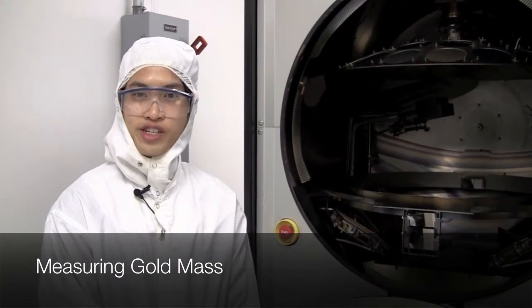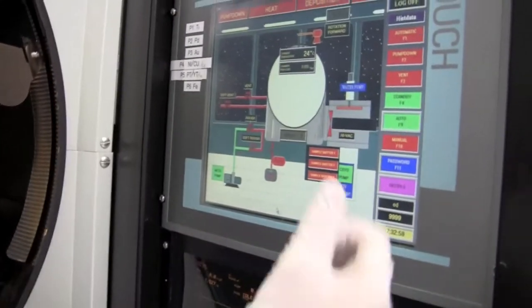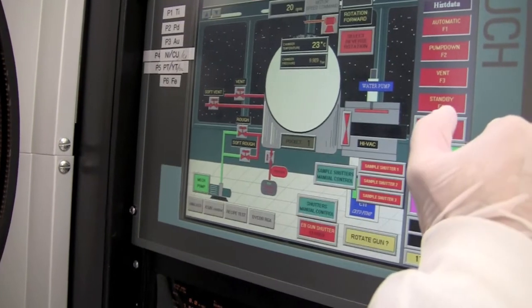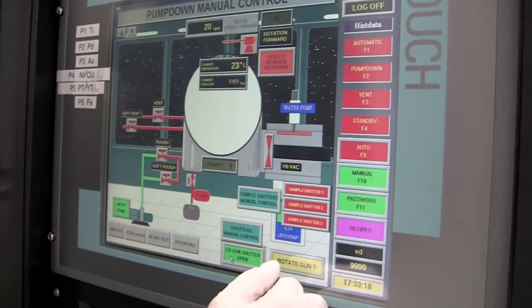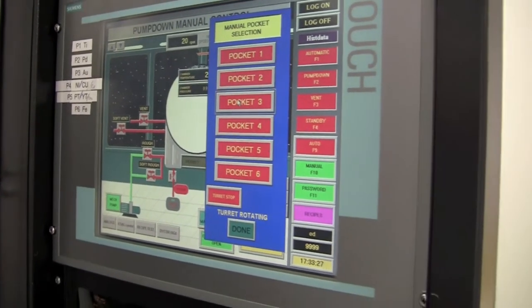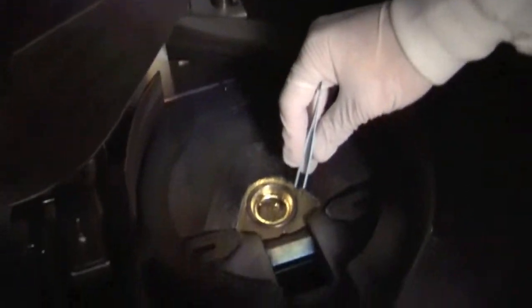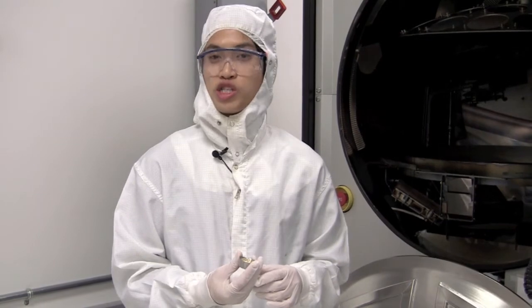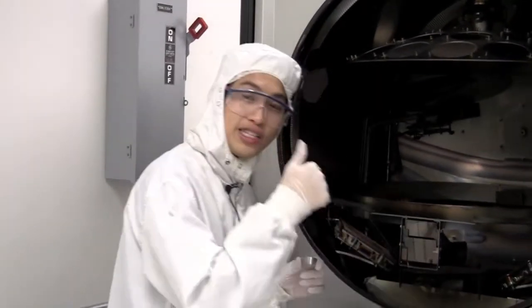Now after we have securely loaded our wafers we're going to need to measure gold. In order to do so on the GUI first we need to collect password and then push m. This allows us to go into manual mode to manually remove the gold crucible for measuring. Once we're in manual mode we first want to open the e-beam gun shutter. You can hear that the shutter is open. And then we can go to rotate gun and rotate it to pocket three where the gold is located. Even if you aren't using gold you want to rotate the turret to make sure it's not stuck from a previous deposition. Now we can see that the gold is loaded and now we can remove it using a pair of tweezers. Now I've removed the gold crucible we're ready to measure our gold to see how much gold we will consume during the deposition. But we want to double check that the carbon spacer is not stuck to the crucible and that it's still in the pocket. I can see it still in the pocket so that's okay.